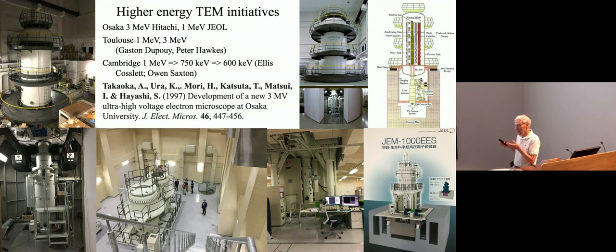But there are enthusiasms there, and there are possibilities, particularly for thin specimens and for STEM, that are worth keeping in mind for the future.